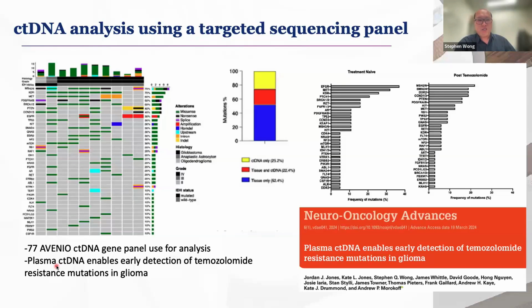This study also provided us the basis that there will potentially be future improvements to the technology, including the need to develop a glioma-specific gene sequencing panel, but also an improvement to the underlying technology for ctDNA analysis in blood, as even though we saw an improvement in detection of up to 40%, there was still plenty of room for improvement.